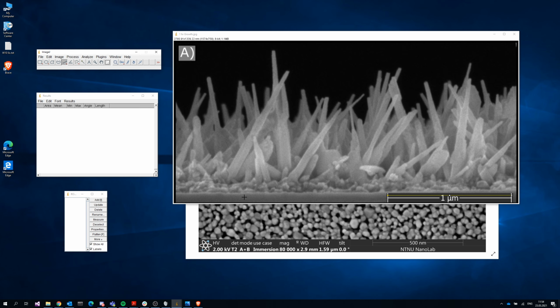This is a cross section. This is the wafer, and what we're going to do is just basically take a measurement like this, press T, add it to our database down there. Take another one, and you want to go to the same point, or roughly the same point. That one might be a bit too far. The particle film here starts here, and we might be going back to it.